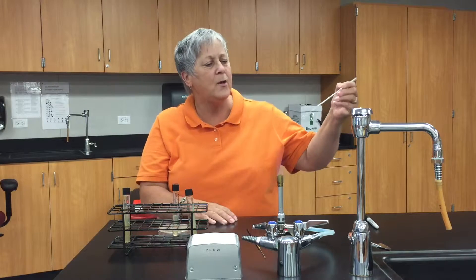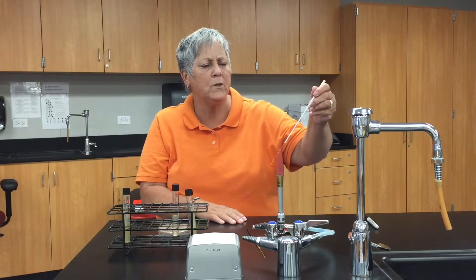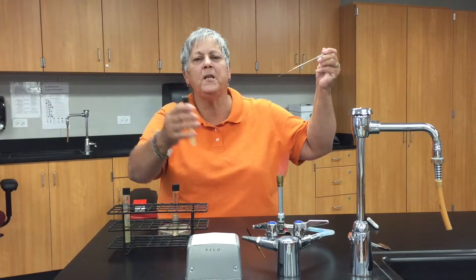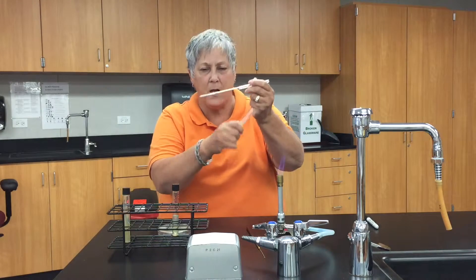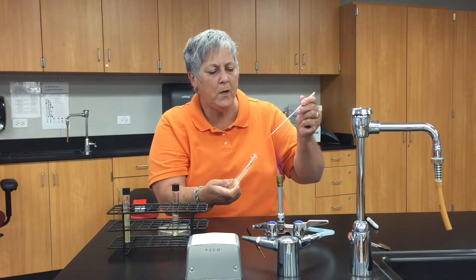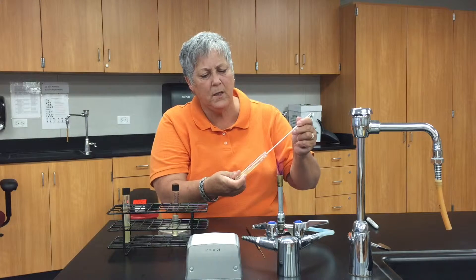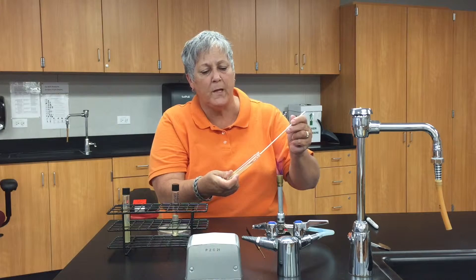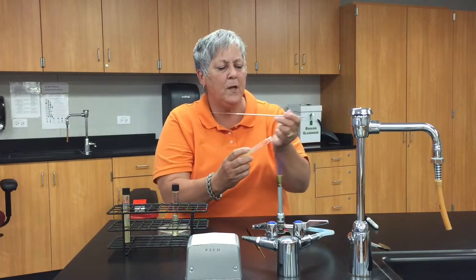I would flame my needle until it glows orange. Of course, I don't have any live bacteria, but let's pretend this TSA slant has the organism you would be testing. I would remove the cap, flame the lip of the tube, and very carefully go into the slant with my needle, removing just a little bit of the organism by gently scraping the surface of the TSA slant. Then flame the lip of the tube again.